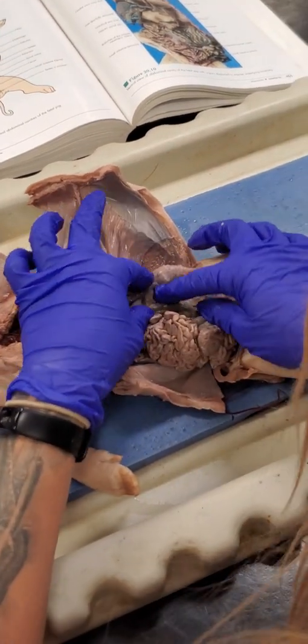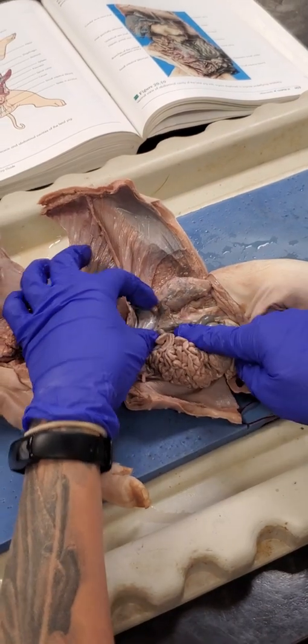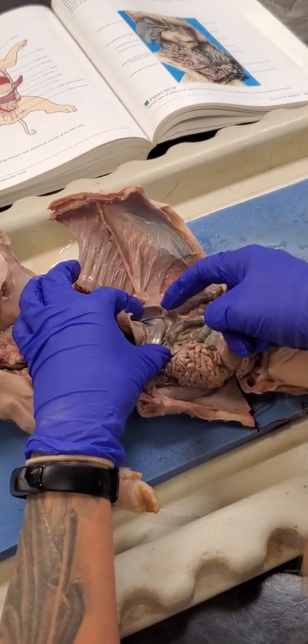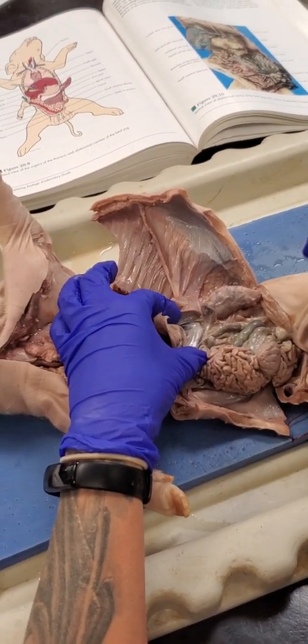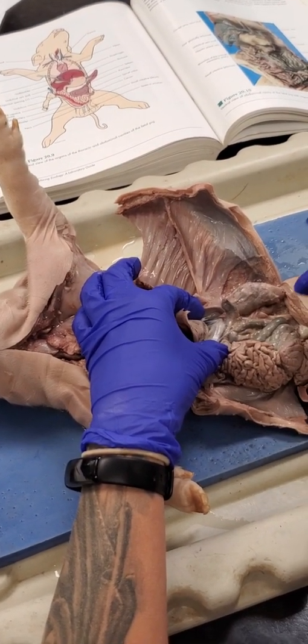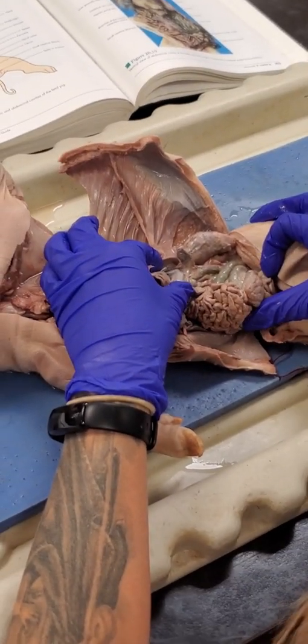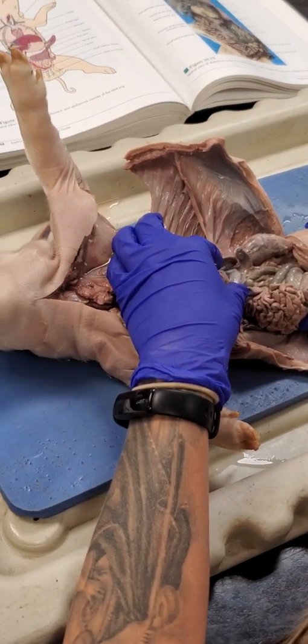But I want to say that this is probably it, just for your own reference. It looks really similar, and it also is connected to it. I just think there are better visual representations of a clear pancreas, if I'm going to ask that term. All right, so pancreas, let's see, spleen.